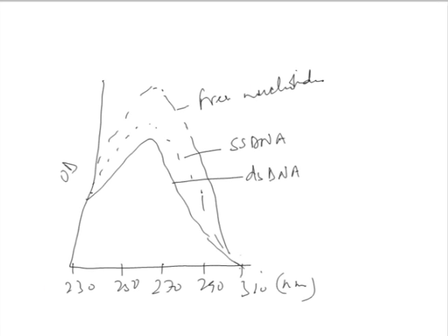So, you can see in here that as the arrangement changes, like in double stranded DNA they are well arranged and you will have a particular spectra, and as this arrangement is loosened, like in single stranded DNA or free nucleotides, there is increase in absorbance. So, these are a few examples where you can see the effect of pH, polarity or orientation on different spectra.